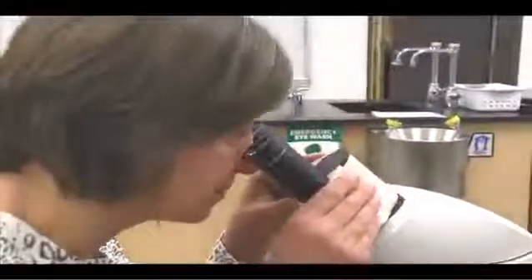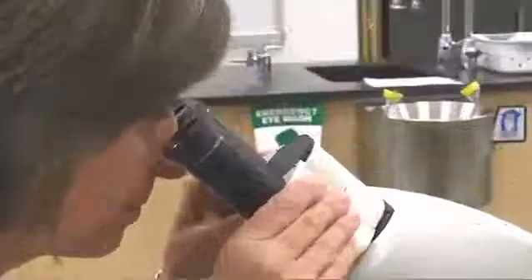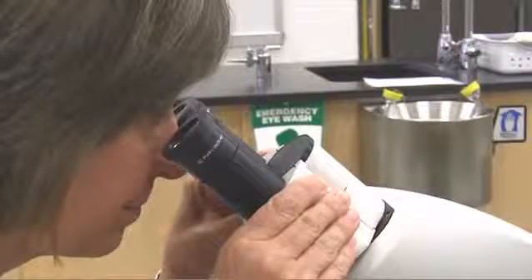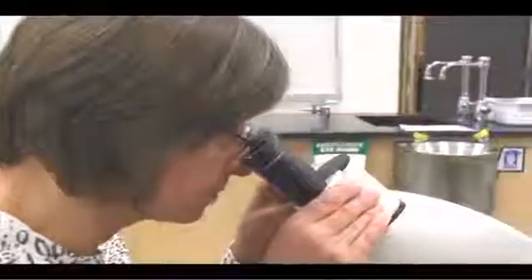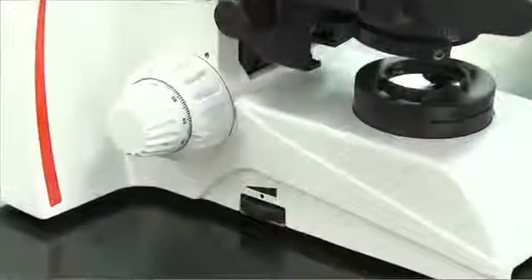Look through the oculars and move the viewing tubes until the image resolves into one circle of light. Do not press your eyes against the oculars — keep some distance. You may use the microscope with or without glasses. Use the rheostat to increase the light to a comfortable viewing level.